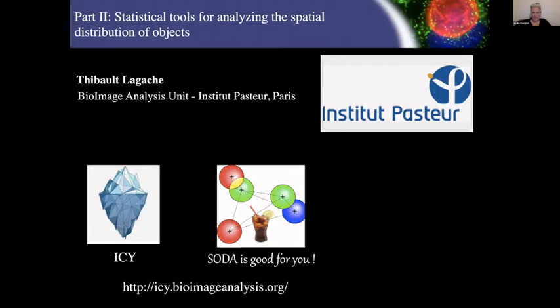So in this second part, I will give some details about the statistics to analyze the spatial distribution of objects. And objects are quite general. This can be in any type of microscopy and also for localization in SMLM, but this is more of a general framework. My name is Thibault Lagache.